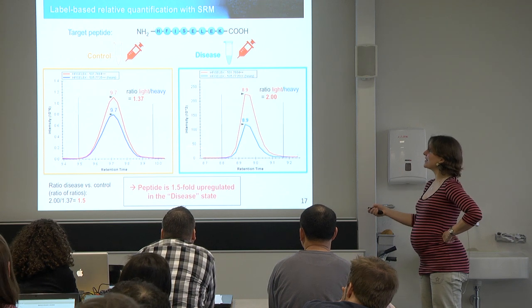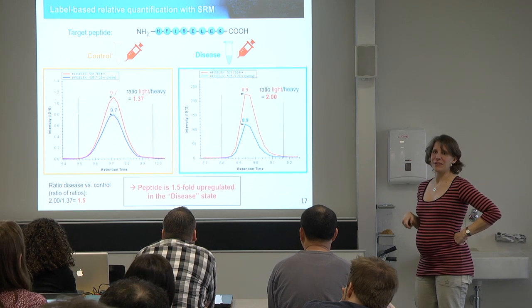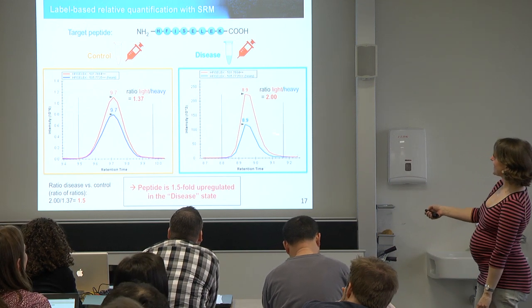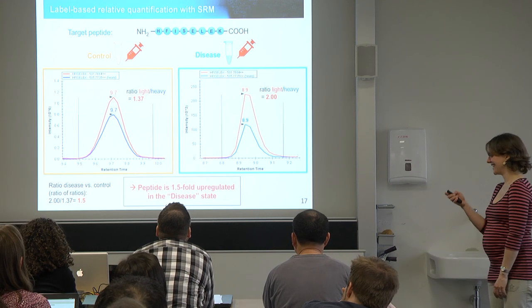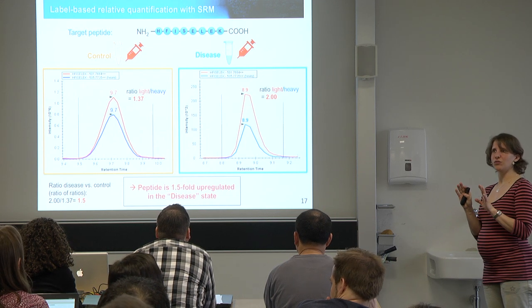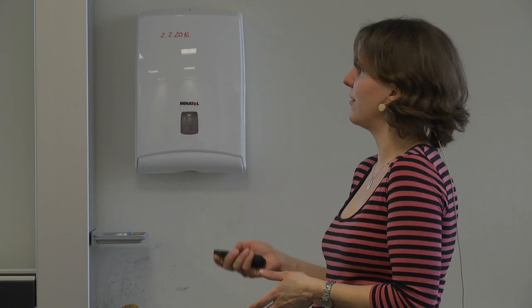Nobody ever got this in any of the presentations so far. Very good. So this is because I just copy-pasted these pictures to make them look nice. I'm not even sure this is the same peptide measured. Very good. Okay, but the principle is clear, that you now know how to calculate a label-free quantitative result and a label-based quantitative result.